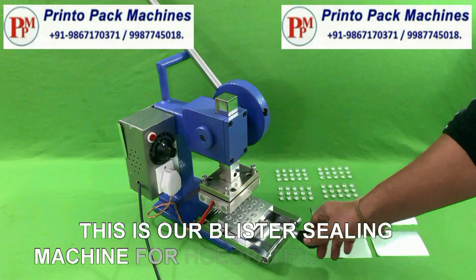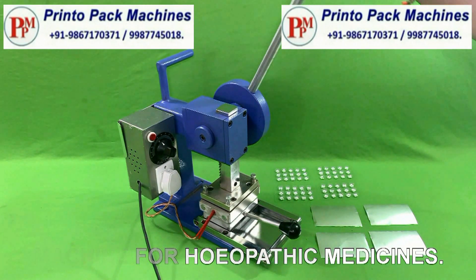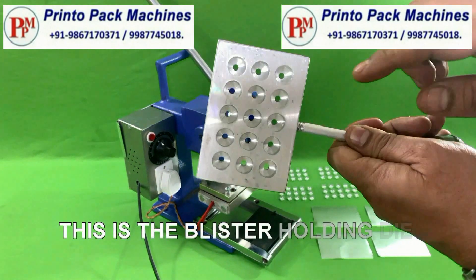This is our blister sealing machine for homeopathic medicines. This is the blister holding tray for holding blisters.